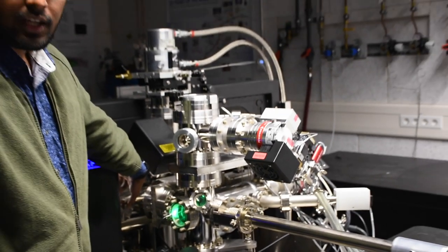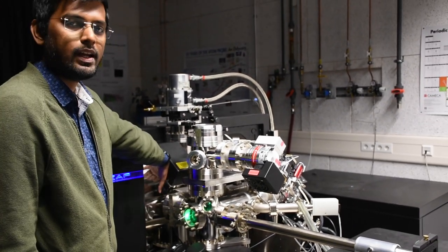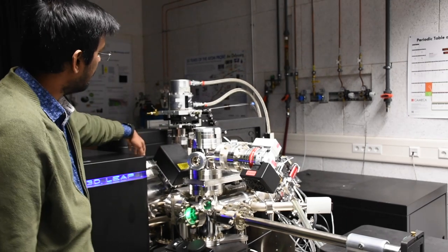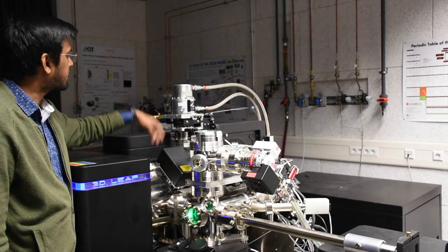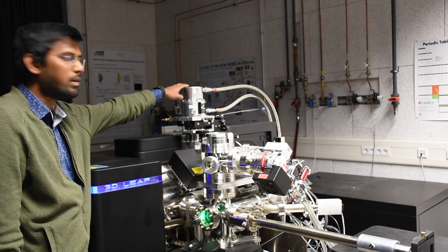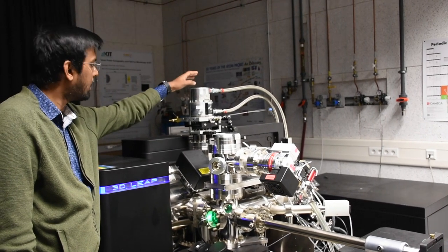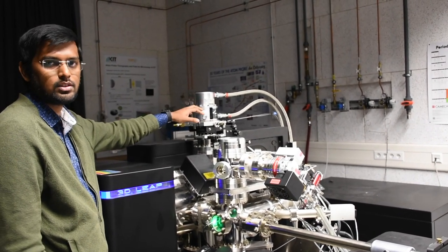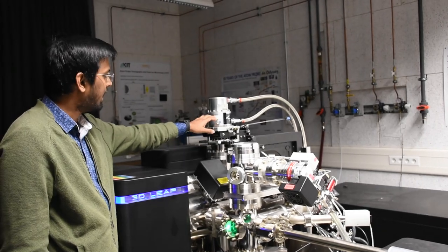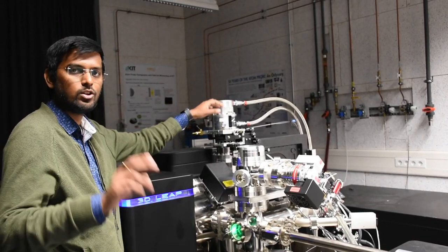Inside the analysis chamber, the pressure is around 10^-11 torr, and we cool our sample using this cryo head. This is the cryo head which compresses helium so that it can cool down the sample to temperatures of 30 to 40 Kelvin. And this is the guy which is making those rhythmic noises.